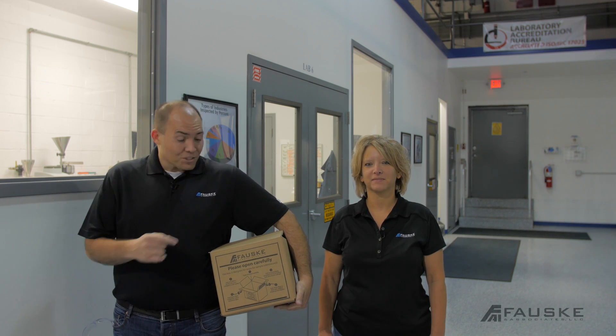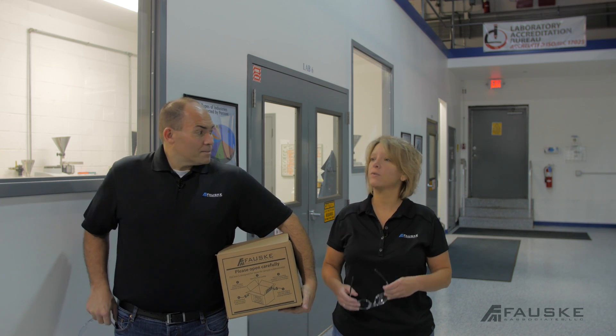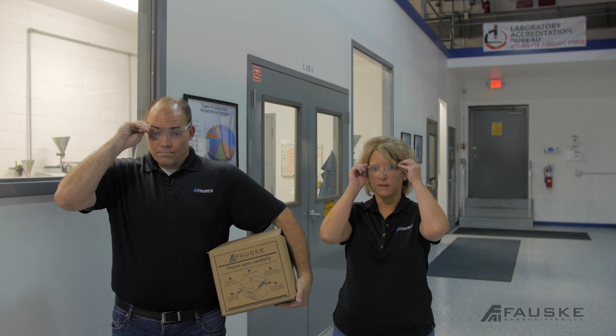Hi, I'm Mark and this is Deb. We're with Fauskin Associates. Our sample has arrived at the lab and we're ready to test. Hold on a minute, Mark. Before we get started, make sure we have safety glasses on anytime we're in the lab. Thanks, Deb. Let's do this.